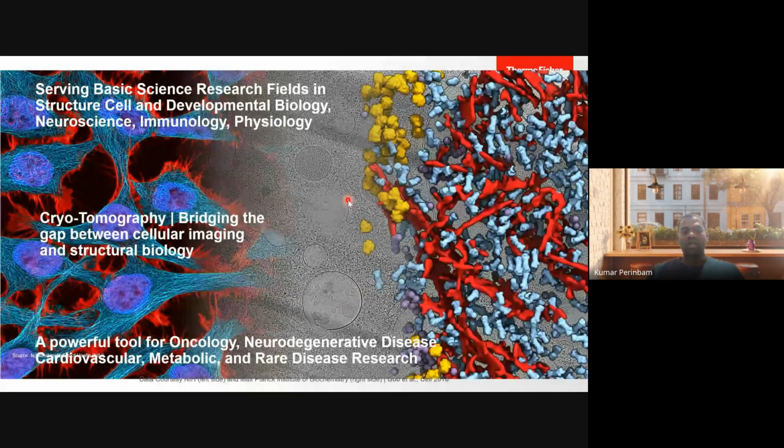But now with cryo-electron tomography, you can see all the structures at the same time, like the nucleus, ribosome, endoplasmic reticulum, and proteins of around megadaltons, and create a 3D image of the entire cell itself. For life science people that is quite interesting because they can see everything all at the same time in one snapshot.